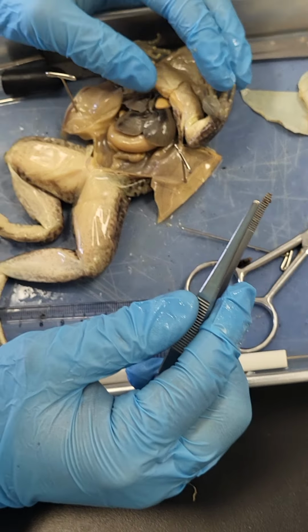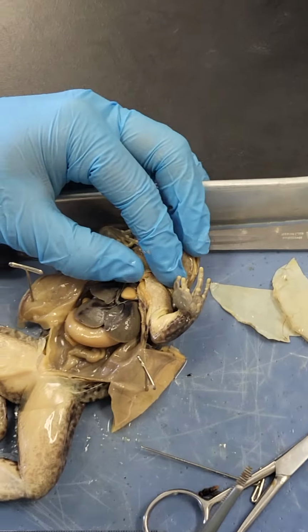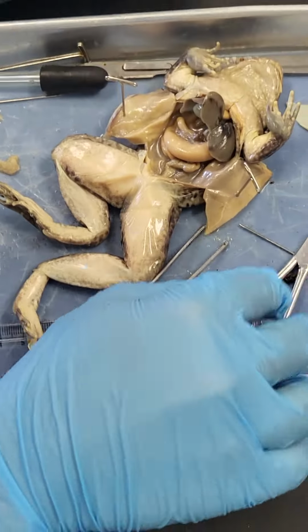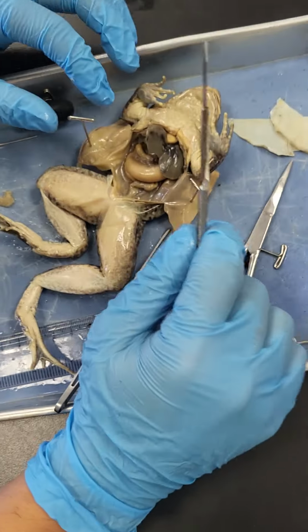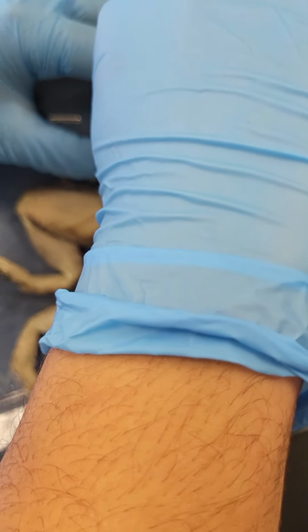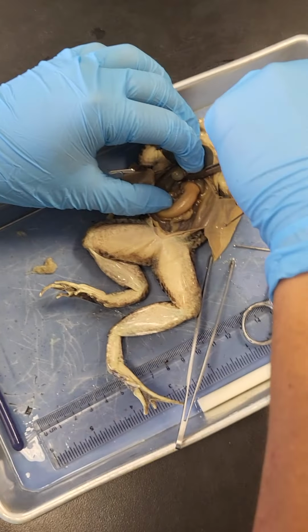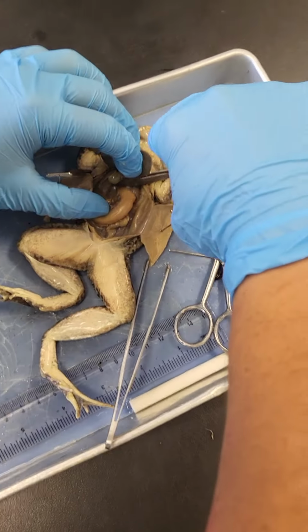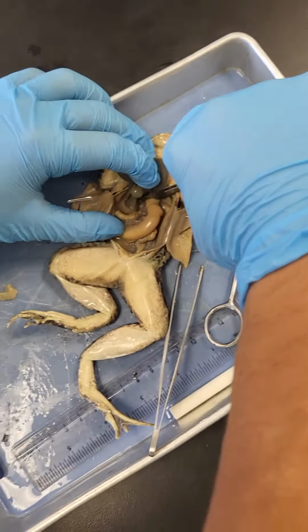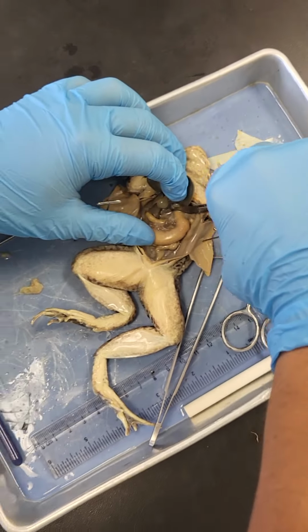Stop if you have not looked at any organs. Removal of the stomach. The stomach from the bottom and top. And yeah, cut the stomach out. Okay, cut the stomach out. You probably need a sharp instrument. Oh my gosh. We need a fork or something to cut it perfectly. I need to pick up my food. I don't want to use my fingers.